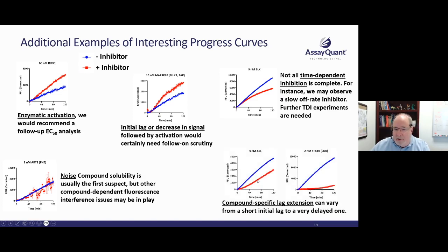And then finally, here's a couple examples of compound-specific lag extension. Here's a little bit. And here's something where the rate is practically 0, but then starts to pick up an hour and a half into the reaction. We do see this sometimes reproducibly.